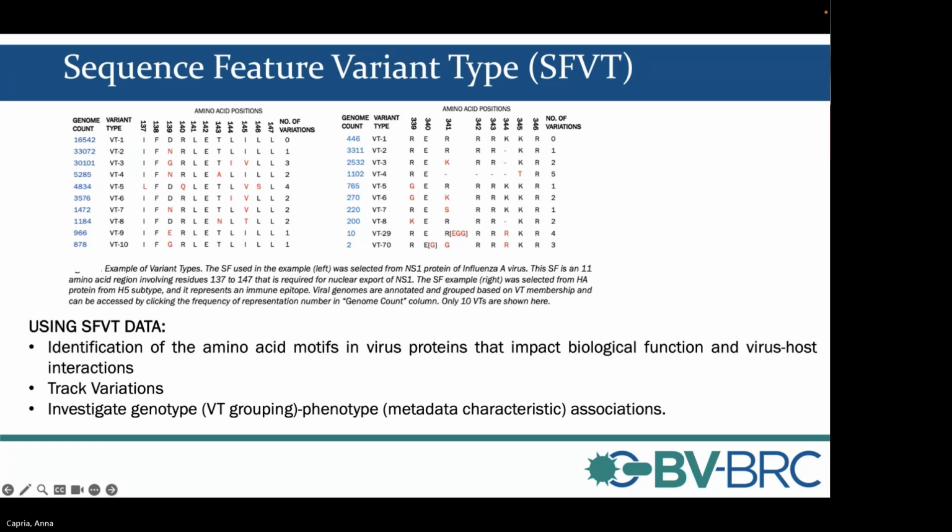So now I will do a demo from the BV-BRC, and I'll share my screen. Okay, we can also wait until I get through the data, or you can do it now, whatever. We can do it later also. Okay, yeah, let's do it later so people know where to find it. Sounds good. Okay.